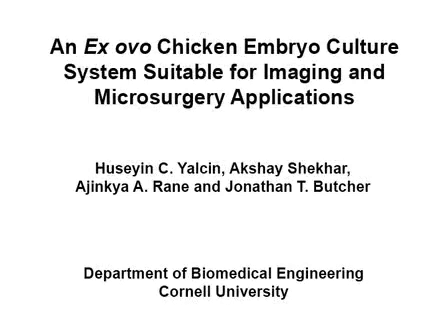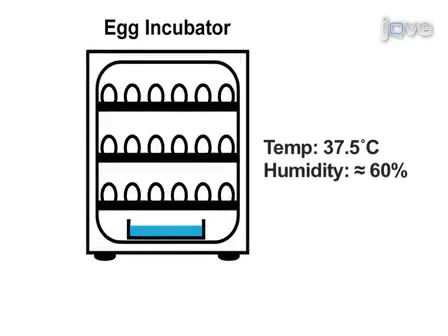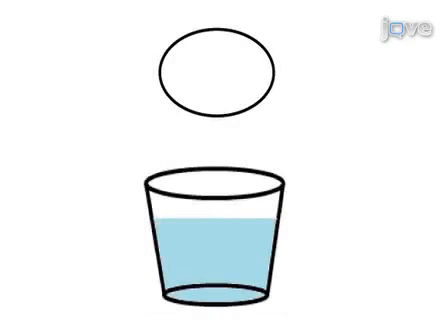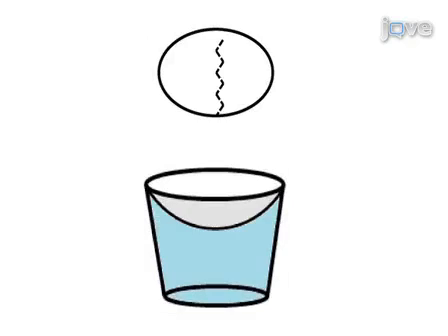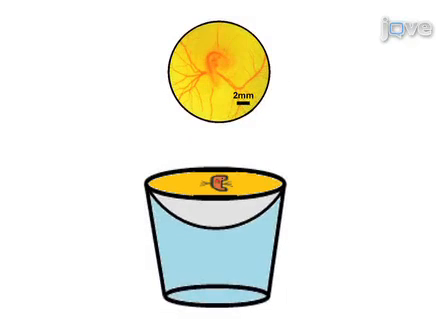In the Ex-Ovo chicken embryo culture system, preparing shell-less chick embryo cultures enables investigation of embryogenesis. The procedure starts with obtaining and incubating fertilized chicken eggs at 37.5 degrees Celsius for 72 hours. Hammocks for holding the egg yolks with the growing embryos are prepared next. Then egg yolks can be transferred onto hammocks and embryogenesis continues outside the shell.